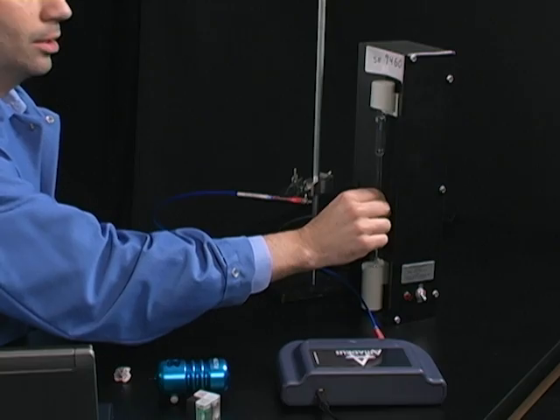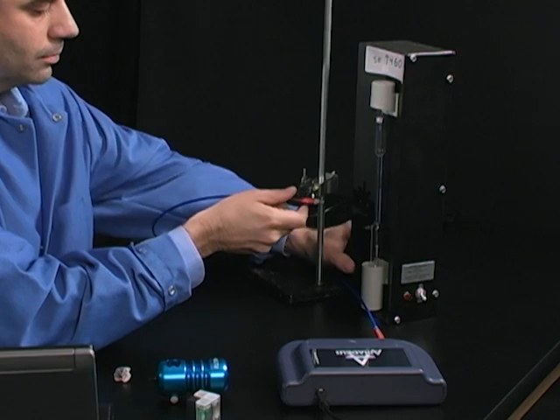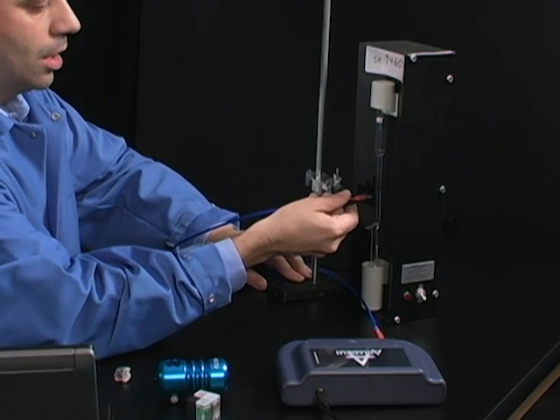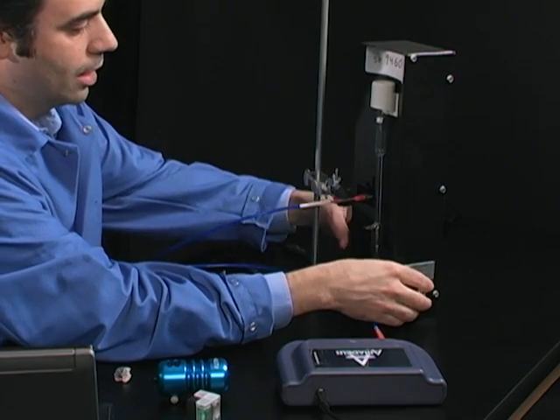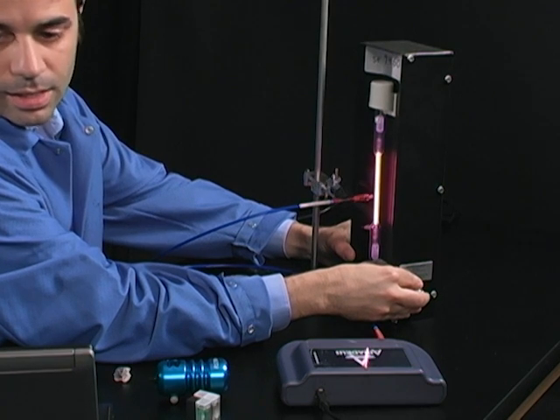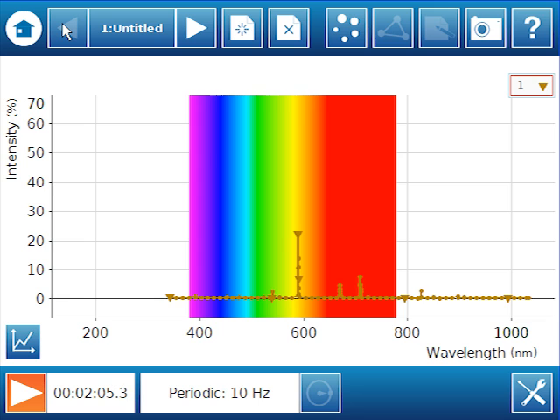So now we can look at a sample you would look at in a chemistry class. So I have helium in here. And I'm going to line this up. And this is where the ring stand and the clamp are very useful. I can get those to line up. I don't have to try to hold it steady or anything. And I'm just going to turn this on. And try to line it up so that we get nice peaks. So we're getting some peaks. So this is where it ties into chemistry where we can talk about the different wavelengths of light given off, correspond to different energies of light, which then correspond to different electron transitions within the atom, ultimately leading to the Bohr model and quantum mechanics after that.